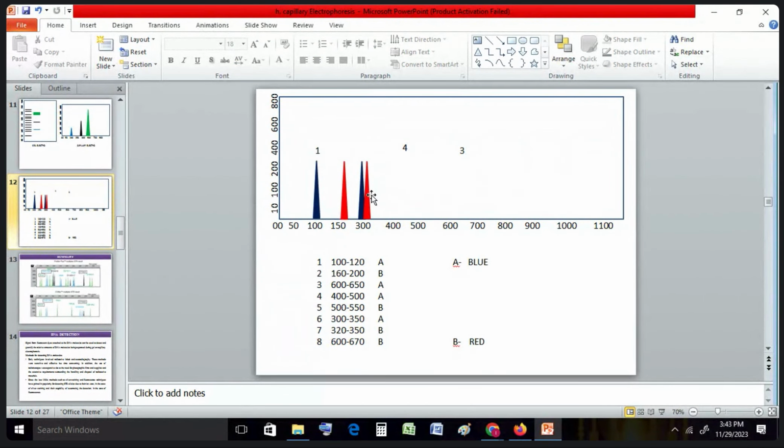So from here you can get all the peaks that are less than 300 in this diagram or graph. By this way, you can check if you know what your result should be. For example, you have a locus that should have a size between 100 and 150.